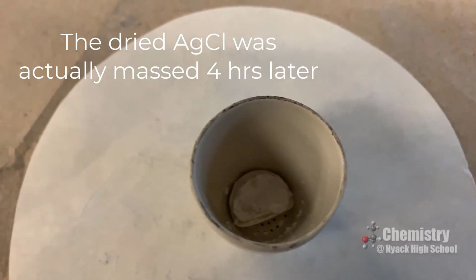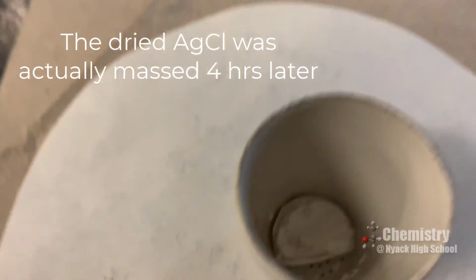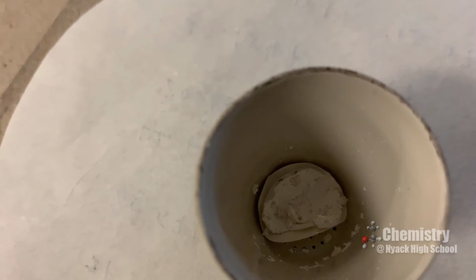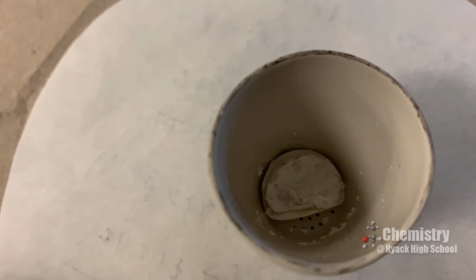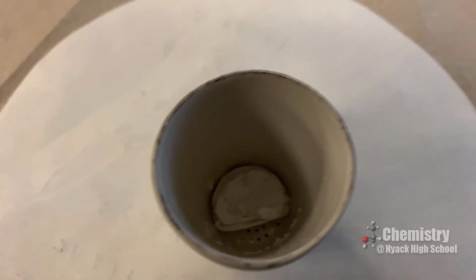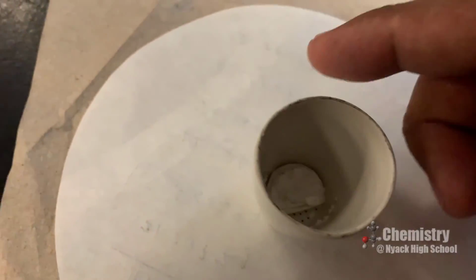Okay, so the silver chloride is ready to be massed. One small problem, I do notice that the filter paper seemed to have curled up during the drying process, but it didn't appear that I lost any silver chloride, so that shouldn't be a problem. So I'm ready to mass the Gooch crucible, the filter paper, and the silver chloride.